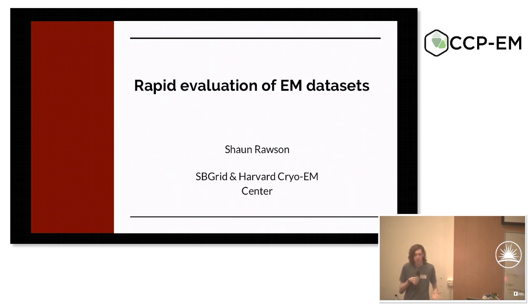So I'm going to talk to you today about how we have our setup at Harvard Medical School at the moment, and in particular, how we're set up so we can rapidly identify and evaluate good data sets in our microscope. So like John said, it's vitally important that we use our microscope time well. There's no point us collecting huge volumes of terrible data on suboptimal data sets. And most of that goes back to grid preparation, and in the end, actually, we find that we end up sending most of our users back to the bench to re-optimize at that point.